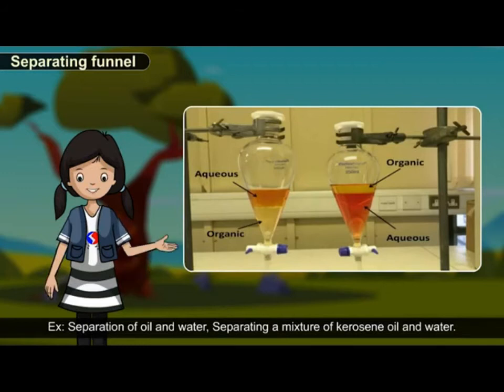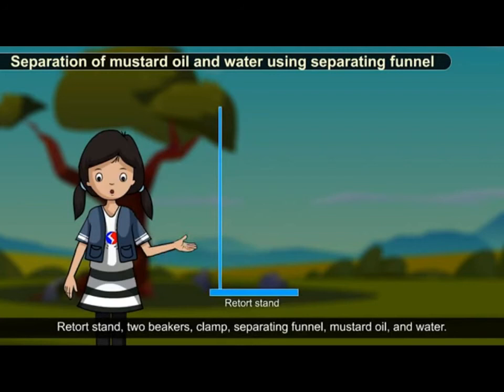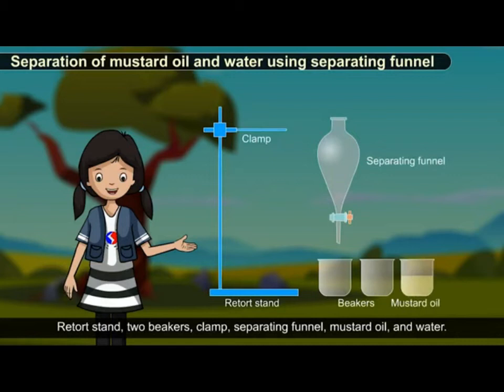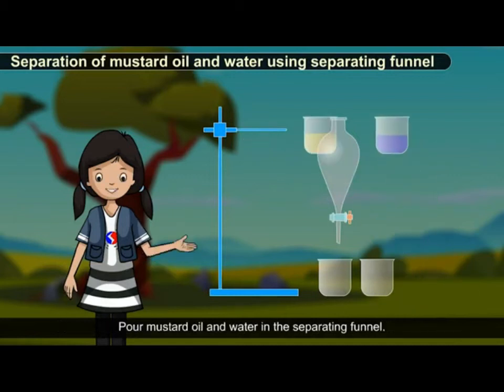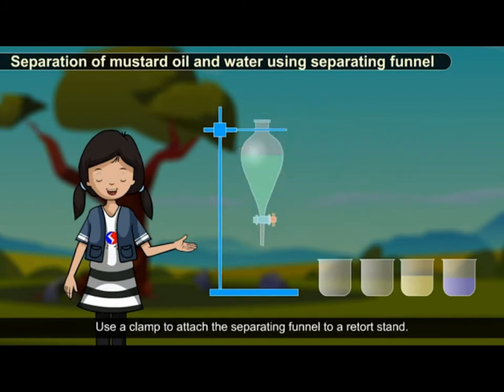Separating a mixture of kerosene oil and water. The following materials are required to do the experiment: retort stand, two beakers, clamp, separating funnel, mustard oil and water. Pour mustard oil and water in the separating funnel. Mix both liquids by shaking the separating funnel vigorously. Use a clamp to attach the separating funnel to a retort stand. Ensure that the separating funnel is in the closed position. Allow the mixture to settle for a few minutes.